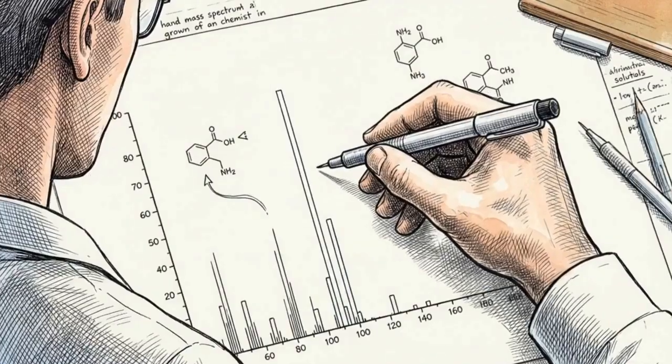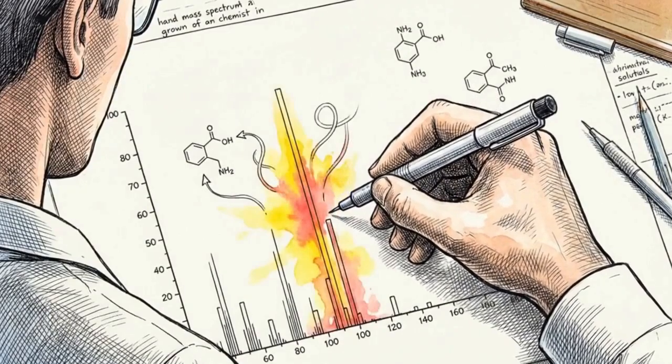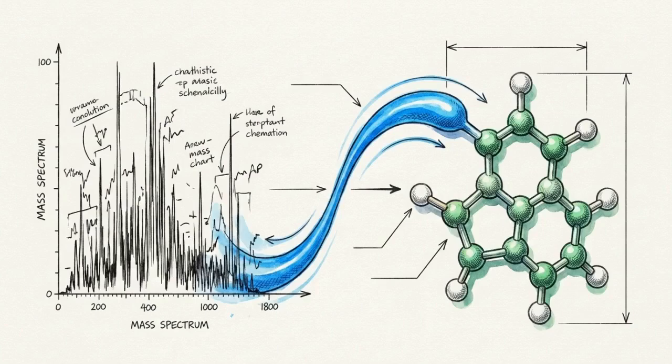Spotting the diagnostic even-mass odd electron ions produced by these coordinated rearrangements is the defining skill in advanced spectral analysis. By understanding the geometries and energy states that trigger these transitions, chemists resolve the chaotic wreckage of a spectrum into a single specific molecular structure.